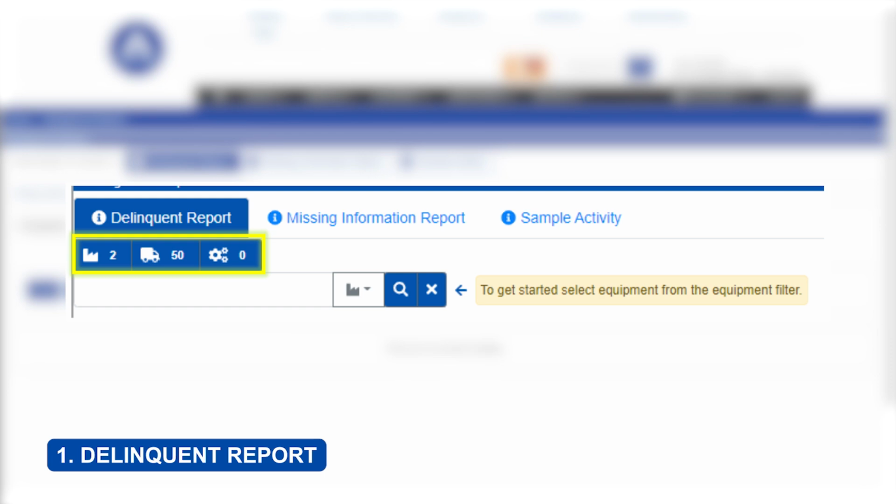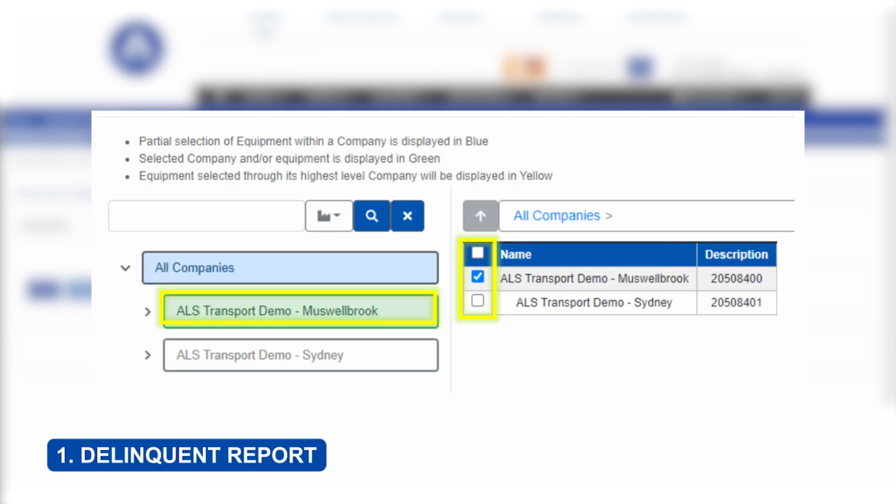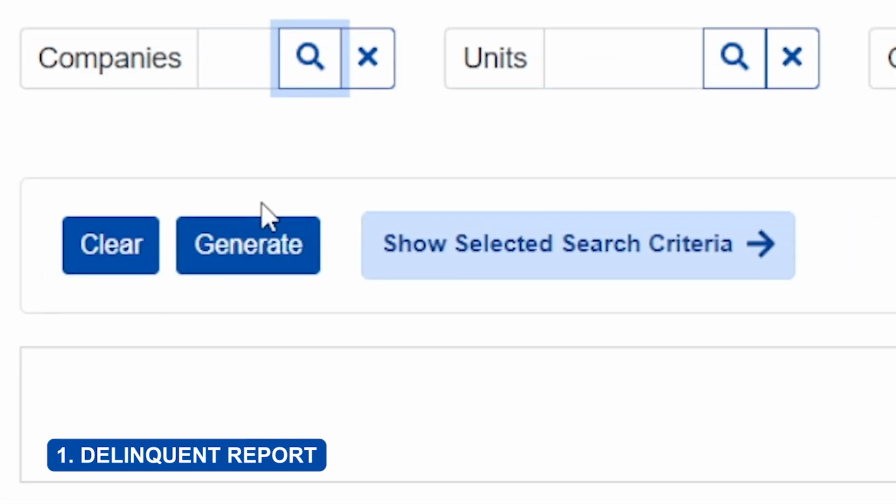To select a single account, click Search. A list of all accounts for the user is displayed. Click on the desired account name. Selection may also be made by using the checkboxes. To generate the list, click on the Generate Action bar.